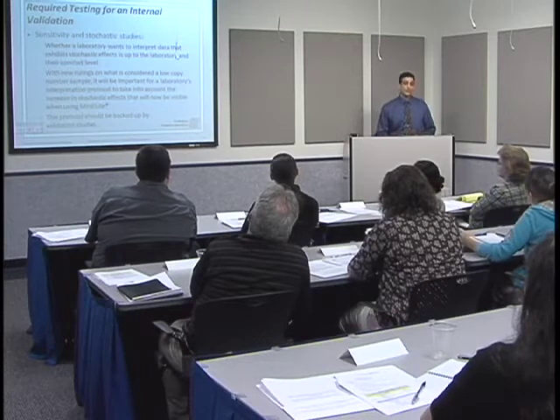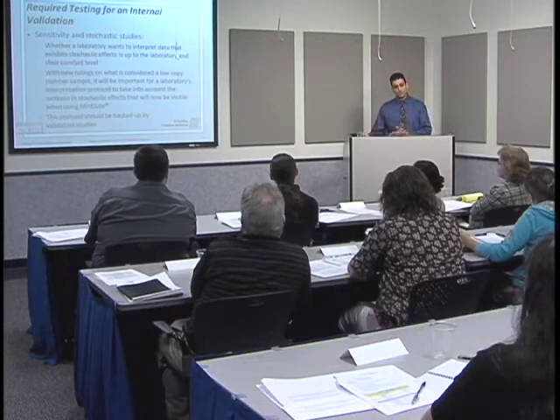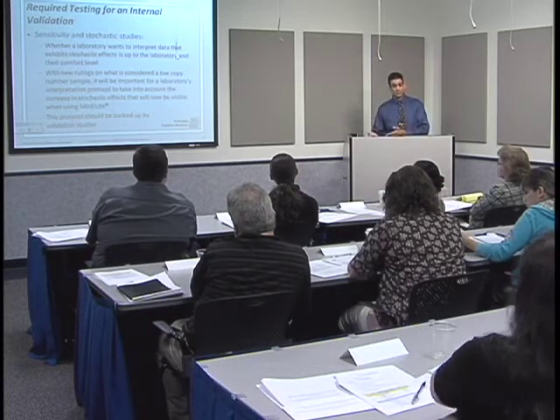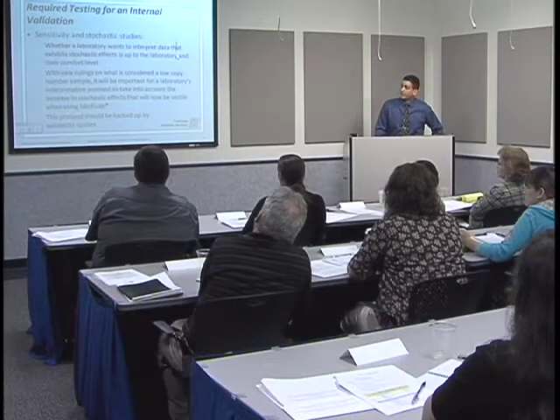That's dropout. Before you could not even tell it was present because it was mixed into your baseline, now you can clearly see that you have some data there, and this data is more visible now, but you have to remember it's low-level data. So it will have the same effects that you would expect to see, the negative effects with low-level amplifications. And obviously, any protocol that you put into place will have to be backed up by your validation studies.